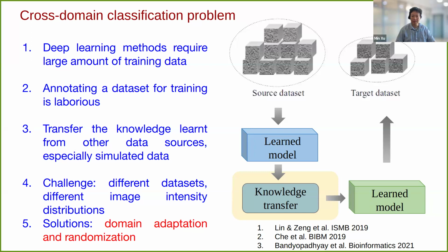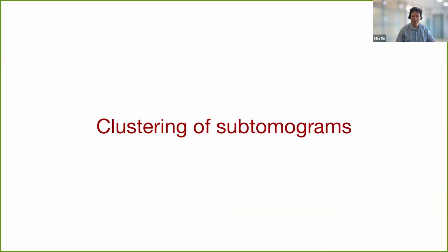Domain adaptation refers to constructing a feature structure on the target domain in an unsupervised fashion, such that its feature distribution is indistinguishable from the feature distribution of the source domain. Domain randomization refers to training a predictive model on synthetic images with widely randomized parameters.